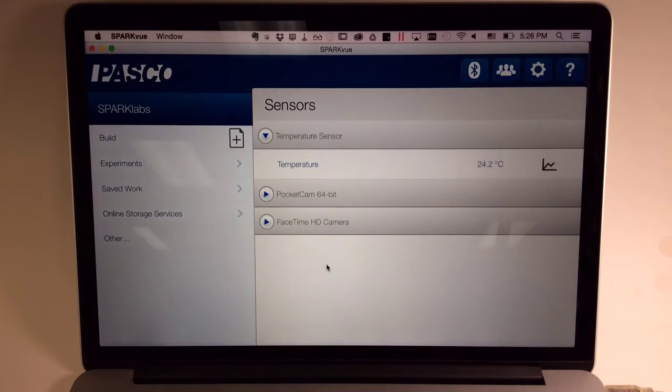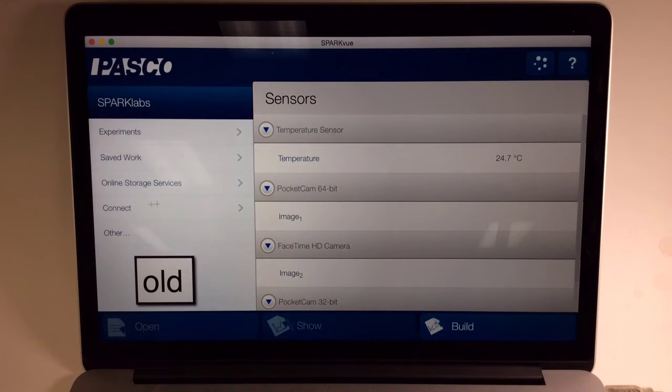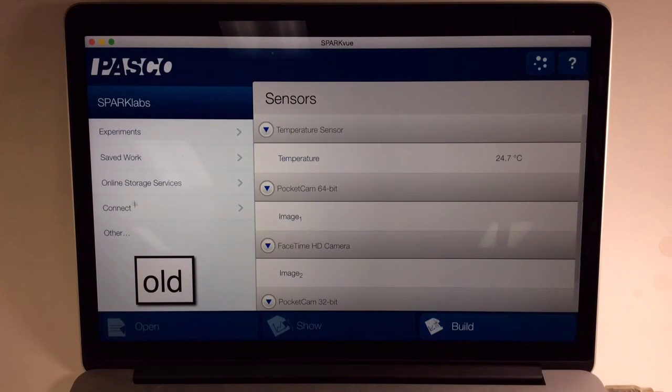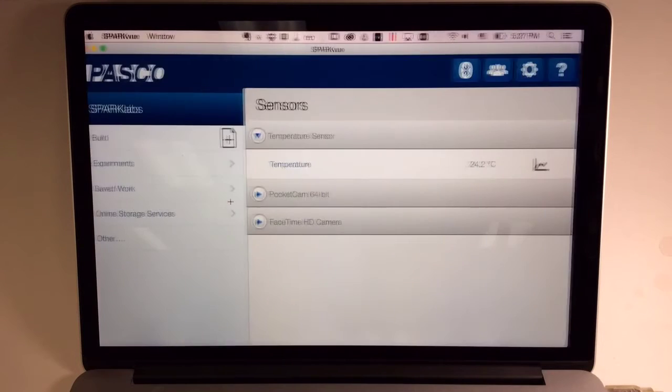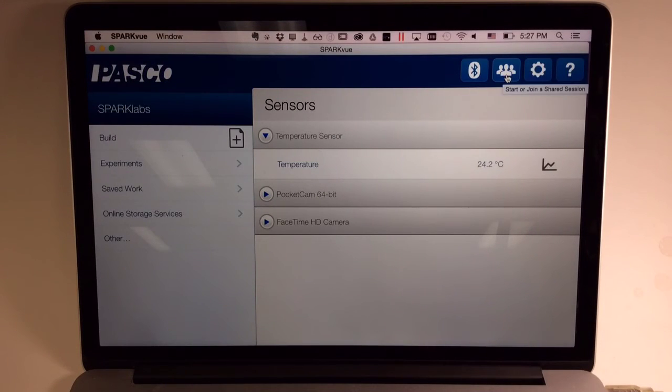A few other smaller changes. The Connect to a Session feature was available in the old version of SparkView along the left side SparkLabs file list. It's now been promoted to its own button at the top of the screen.